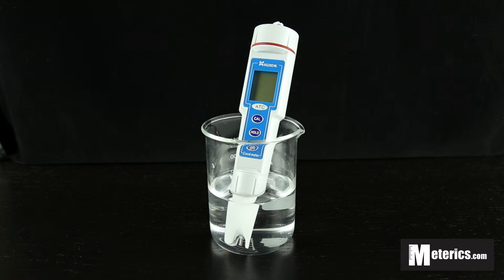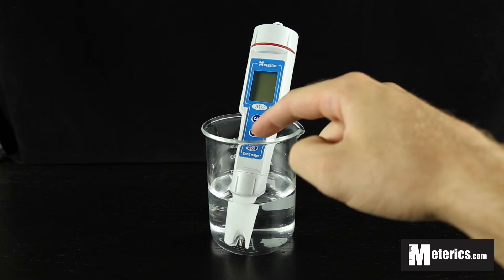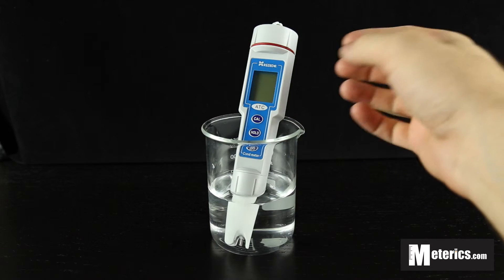Hi guys, I'm here with Metrix and today we're going to be looking at the Kadido CT3031 conductivity meter. This pen style meter is very simple by design and it features three buttons: the on and off, the hold button, and the calibrate button.